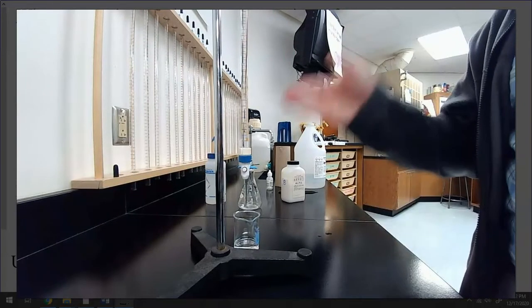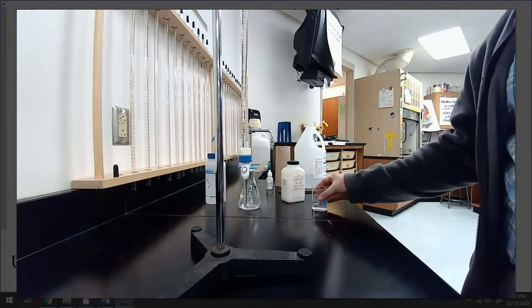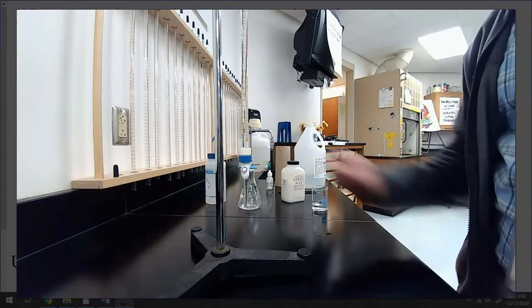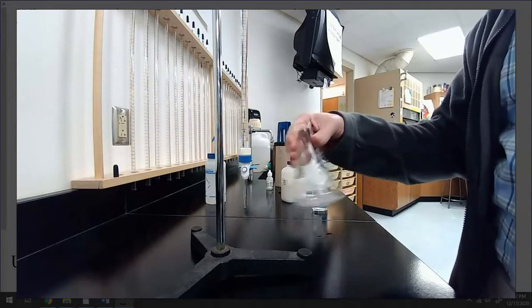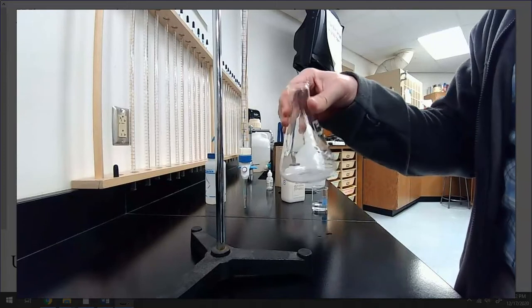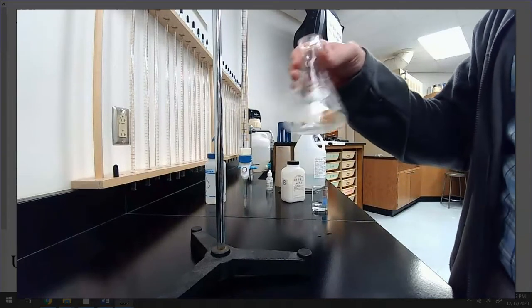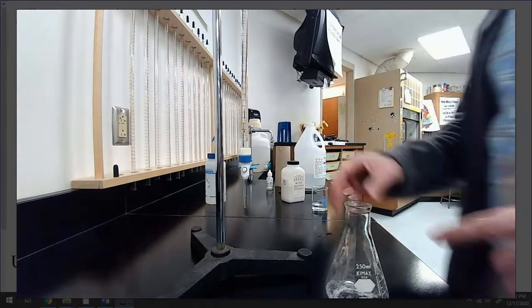So here we go. I have done this. My burette is now filled with sodium hydroxide, and we can begin our first titration. Here's my 0.506 grams of unknown acid A. However, I don't want to run the titration just into the solid acid. I want to dissolve this first.